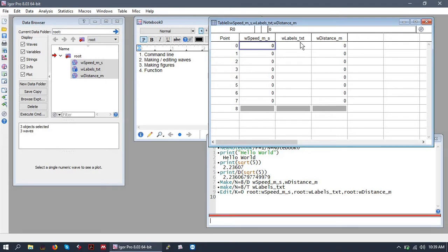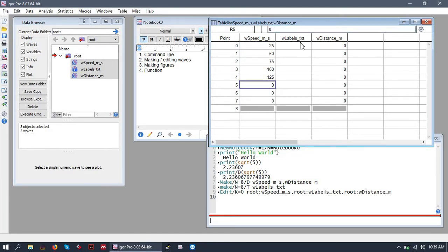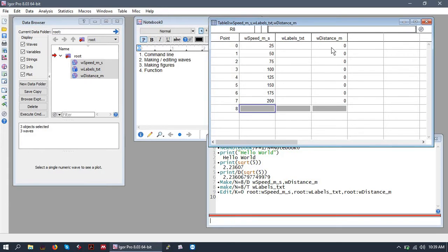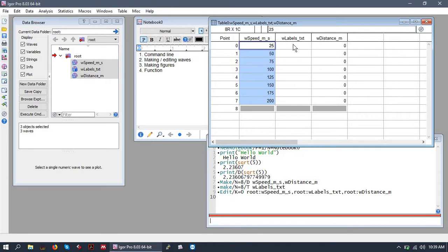To edit them simply put some numbers in. So I've put some numbers in the speed wave and let's put some text labels in our text wave.